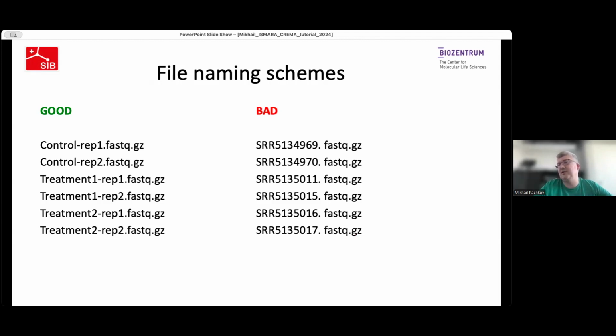This is what you can usually obtain from a database, but it's really hard to interpret later on. So I strongly suggest that you make some effort before uploading the data and rename the files correctly. For people who use Linux-based machines, the easiest thing is to create symbolic links to the files with the desired names, and then use these symbolic links to upload the data.